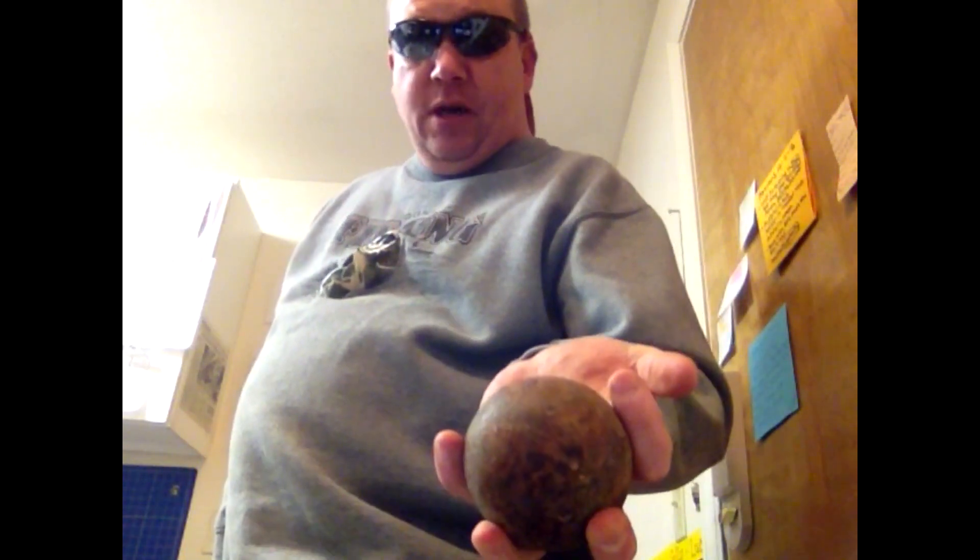The thermite reaction is iron oxide reacting with aluminum to form iron and aluminum oxide. Iron oxide is rust. So I have two rusty milling balls that a good friend of mine has given to me, and you can see they're pretty rusty. The rustier the better. And then you need good old fashioned aluminum foil.